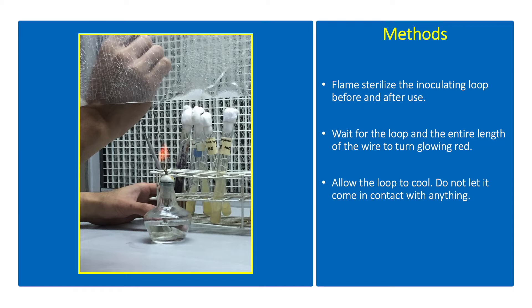Flame sterilize the inoculating loop over the flame of an alcohol lamp. Wait for the loop and the entire length of the wire to turn glowing red. This will incinerate all contaminants present on the wire before its use for the transfer of pure bacterial culture. Allow the loop to cool. Do not let it come in contact with anything.